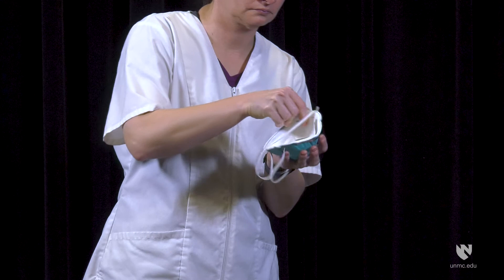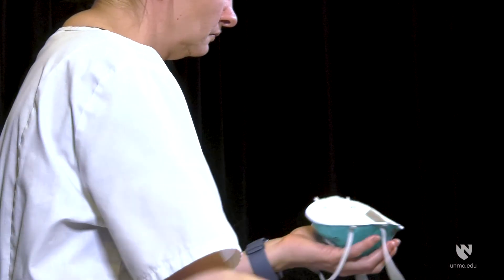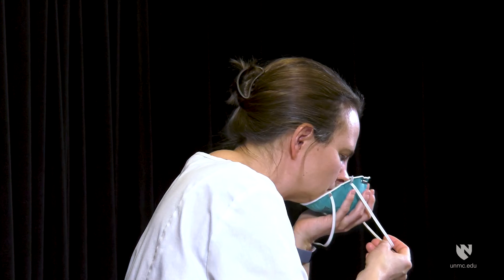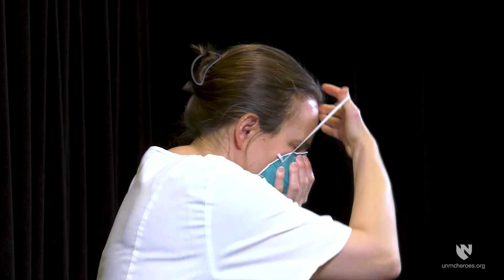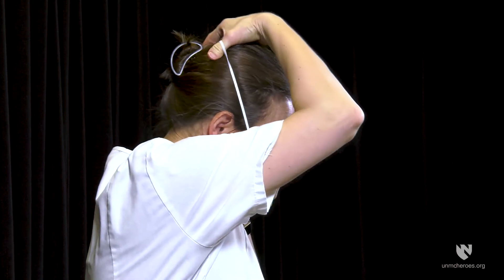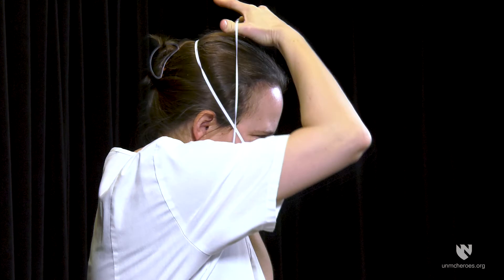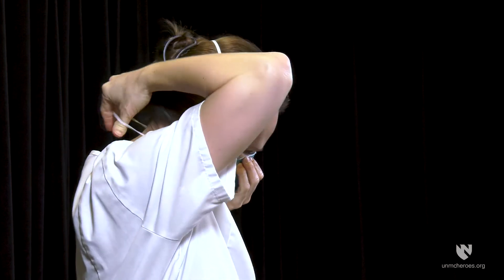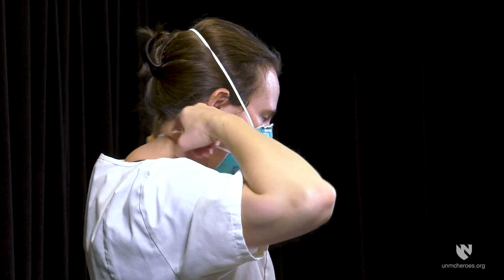Cup respirator in one hand with nosepiece at fingertips. Allow straps to hang freely below hand. Hold respirator under chin with nosepiece up. Place the upper strap across the crown of the head. Place the lower strap below the ears at the nape of the neck. Ensure that the straps are not twisted.